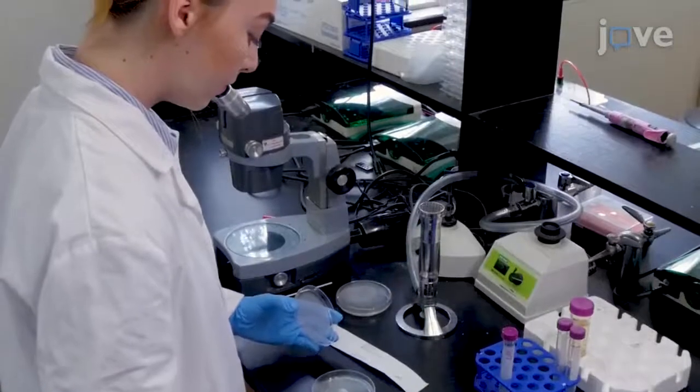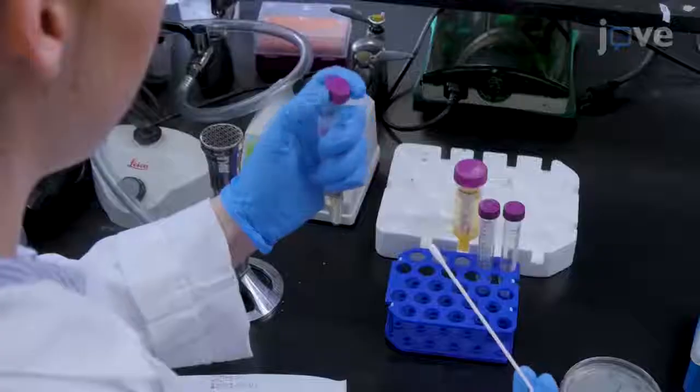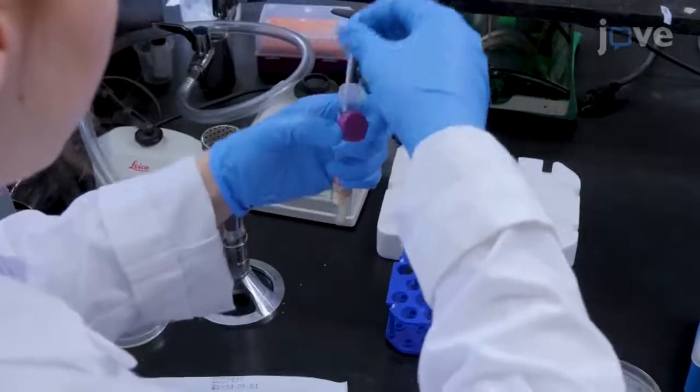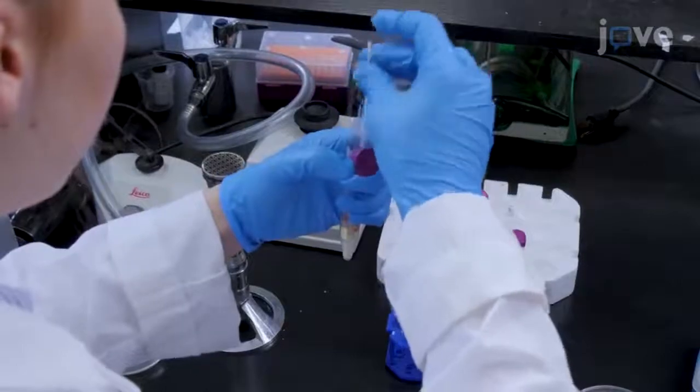The next morning, use a sterile applicator to collect GC colonies from each plate, and resuspend each swab in warm broth supplemented with 4.2% sodium bicarbonate and 1% Kellogg solution.